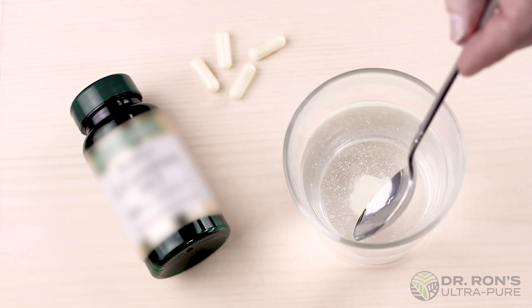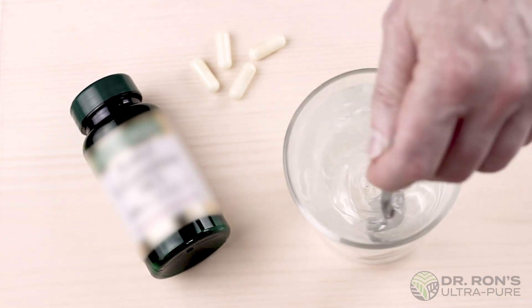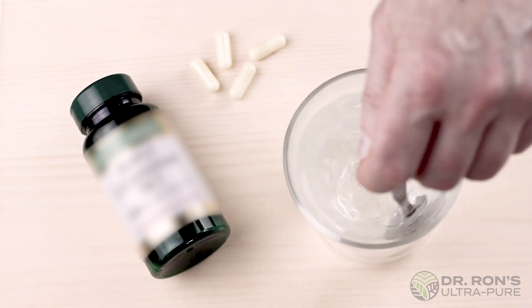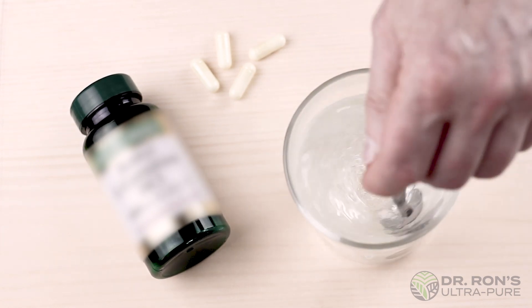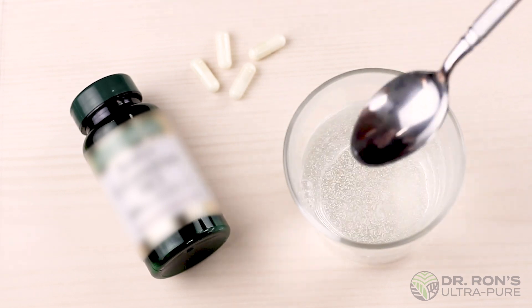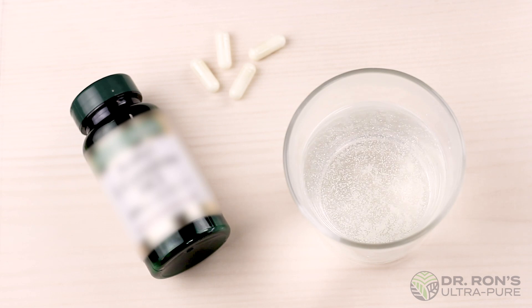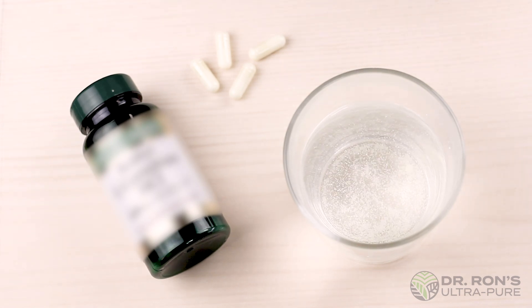We recirculated the powder coated in stearate a couple times with little to no effect. Though it's not shown here, we then allowed the cup with the stearate-coated formula to sit for a couple days and witnessed absolutely no change.